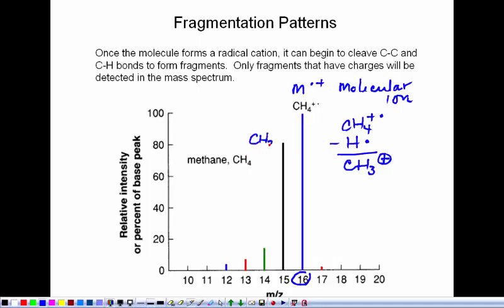the methyl carbocation. And now before anybody gets all excited and says, now wait, in lecture, if we wrote a methyl carbocation, you would take points off, which is true. Do they exist? Well, in solution, primary and methyl carbocations don't exist all that much. But we're dealing in the gas phase. And so in the gas phase, primary carbocations and methyl carbocations are perfectly fine. And they have to be perfectly fine because I see a peak right here due to that. Okay, so the methane will break apart and lose a hydrogen atom.